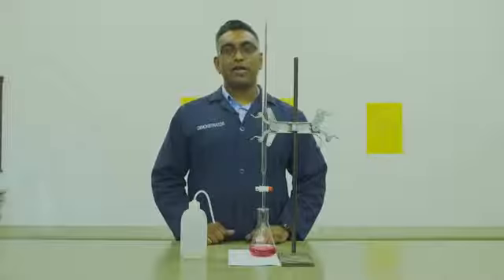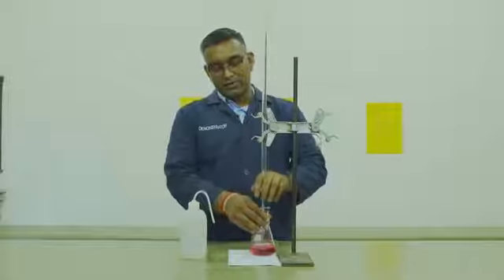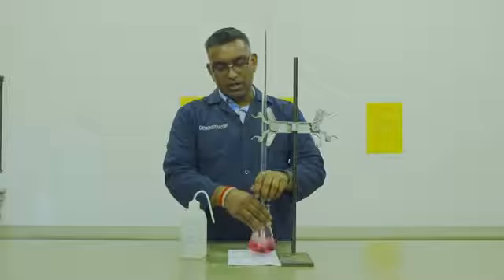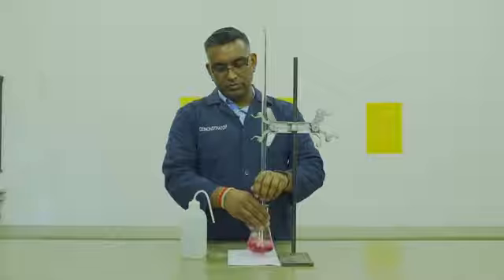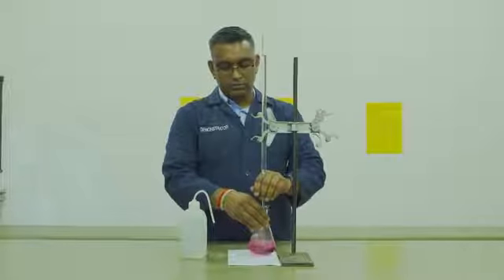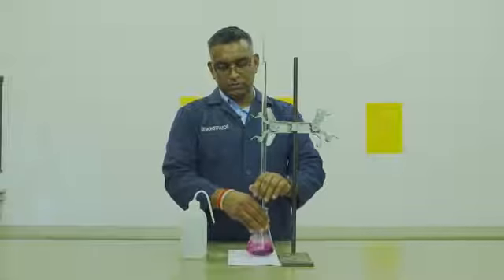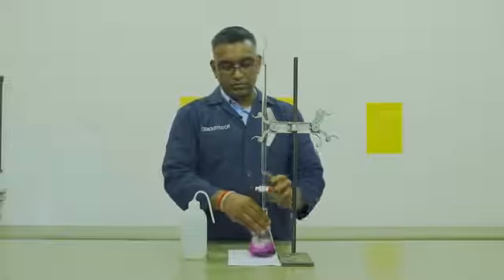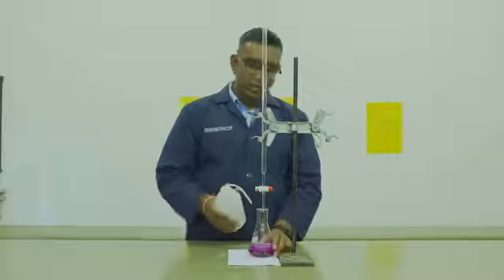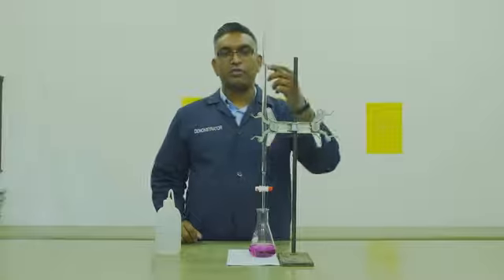As performed in part A, you will take your initial volume and start your titration. You will notice the pink color change to a purple color. You will then wash your jet off with some deionized water and record your final volume.